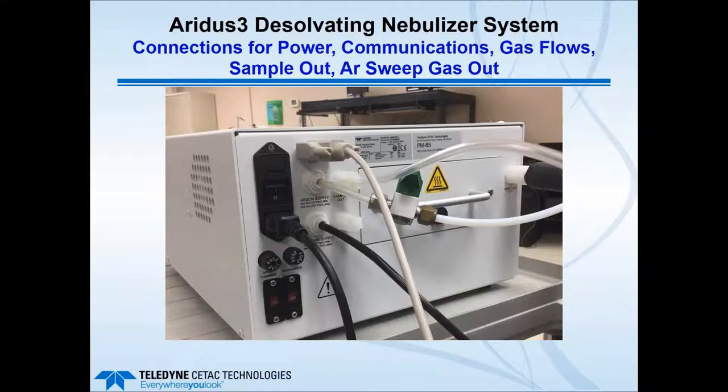Connections to the back panel, of course, we've mentioned the argon sweep gas and the nitrogen addition gas. Power, these two gas flows, argon sweep gas and nitrogen addition gas. Computer connection, which allows the mass flow controllers to be activated. And then the sample outline and the sweep gas outline all will attach to the back panel.